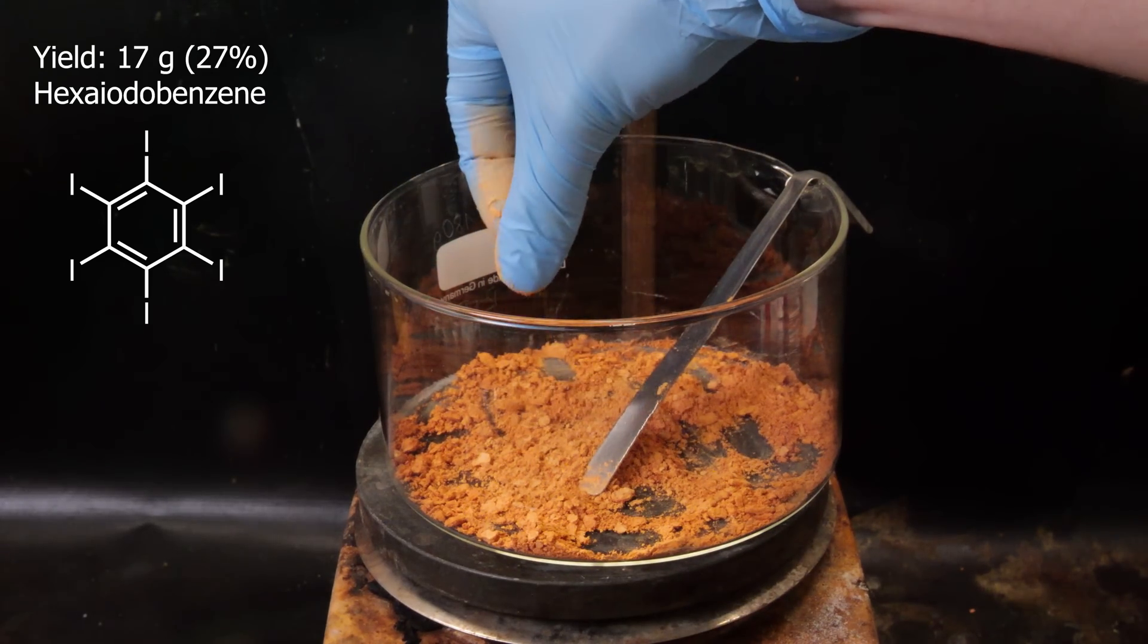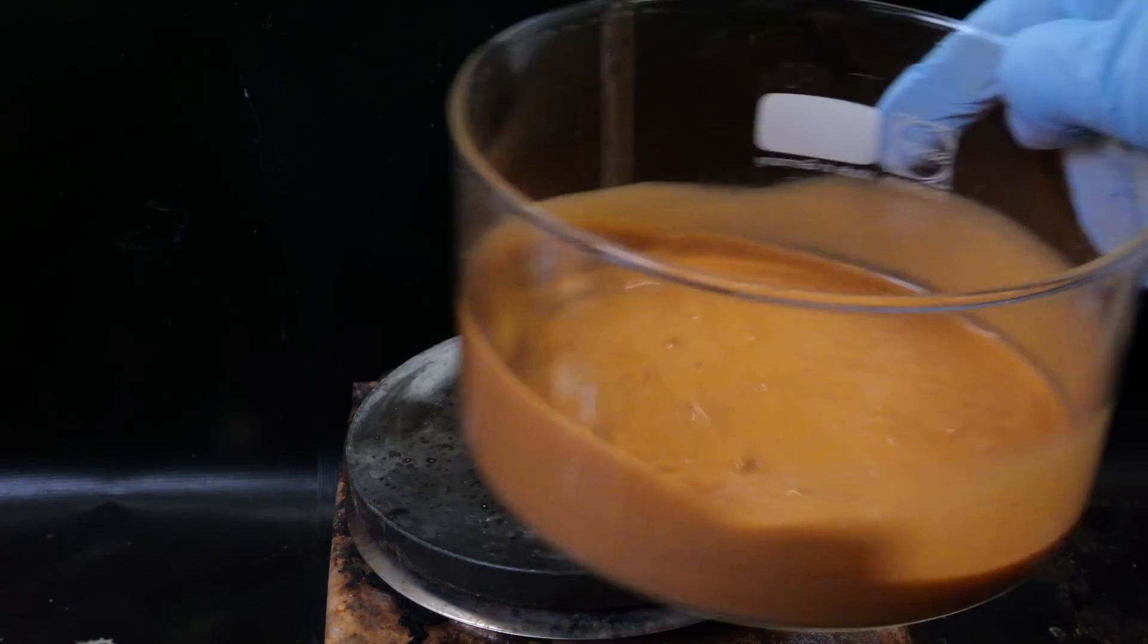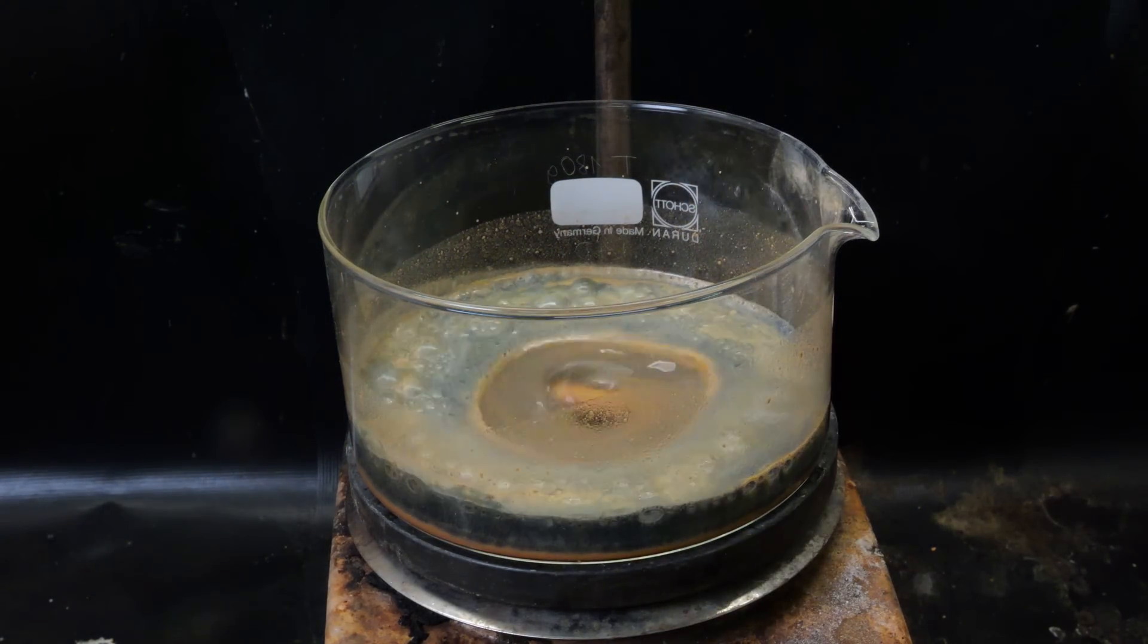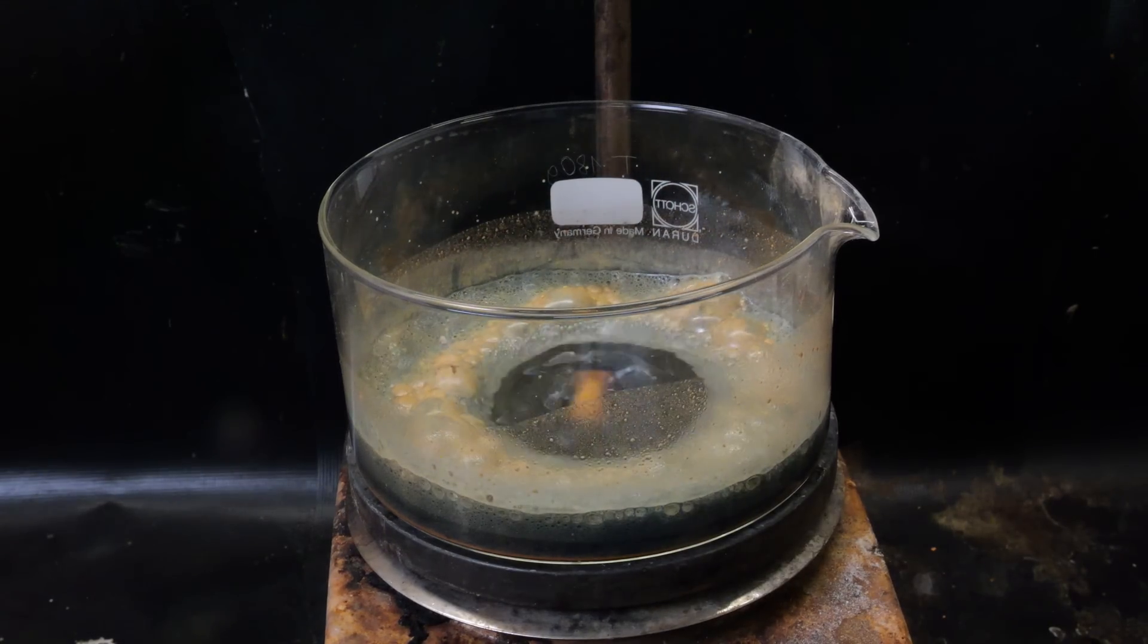While any partially iodinated impurities would be destroyed by it. So I cover the material in concentrated sulfuric acid and then slowly add hydrogen peroxide. This creates the piranha solution that reacts immediately with any organic compounds.